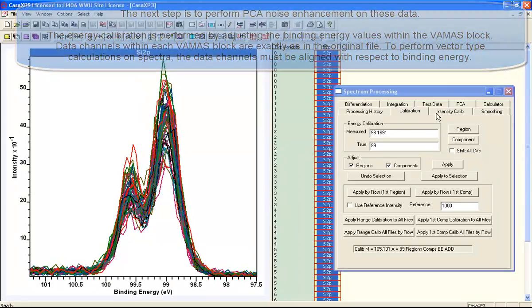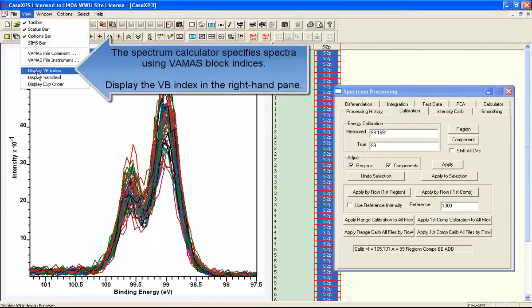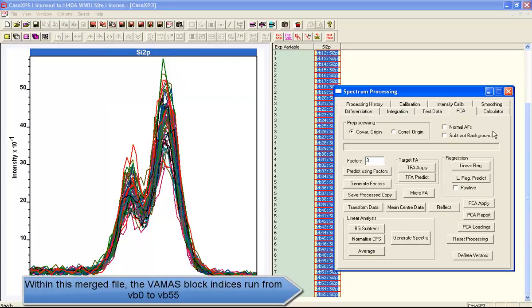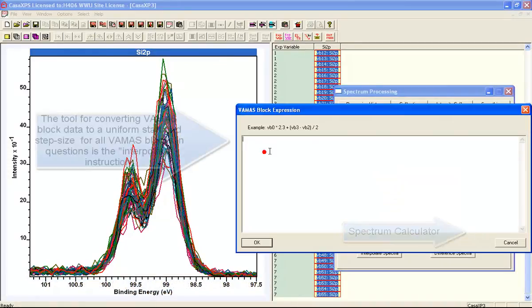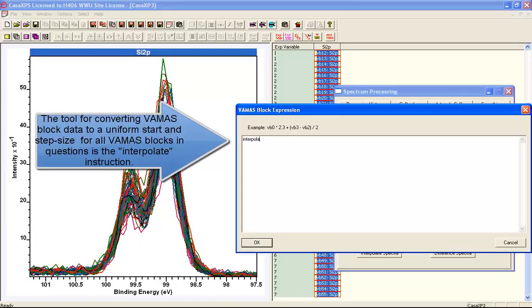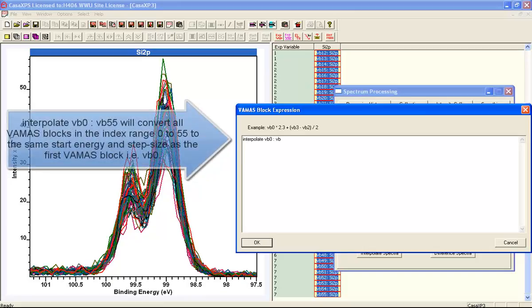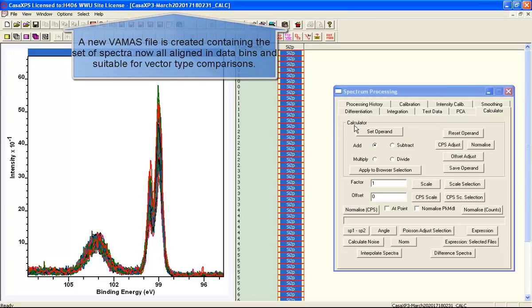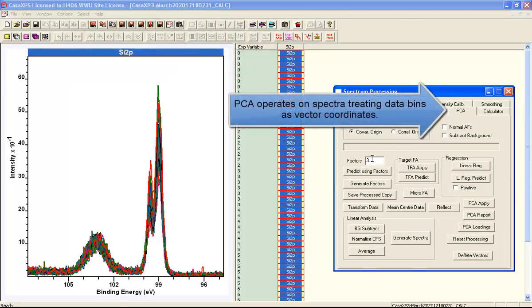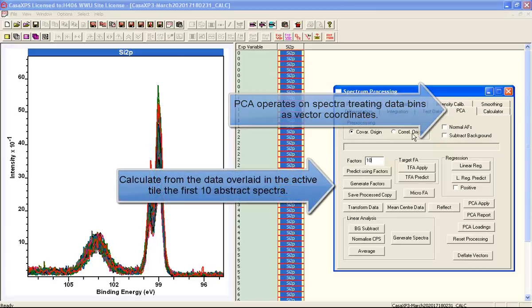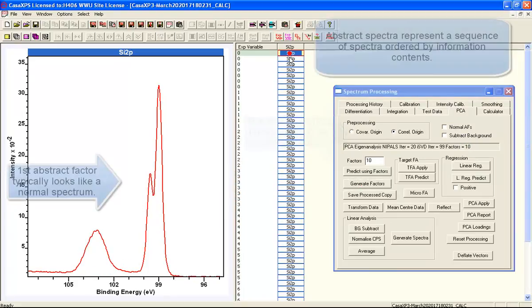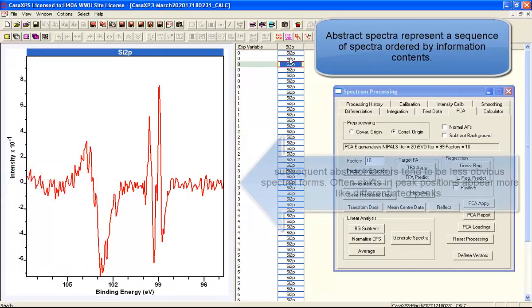The reason we're doing these calculations is to end up with a set of spectra that can be treated as vectors. Any PCA-type calculation requires data bins to align because they're going to be treated as coordinates in a vector. So the next step is to interpolate all of the spectra that were shifted and copied to a new file using the energy calibration, so that the same data bins are now present in all of these VAMAS blocks. We can then perform a principal component analysis to look at what abstract factors are within the data set as a whole.